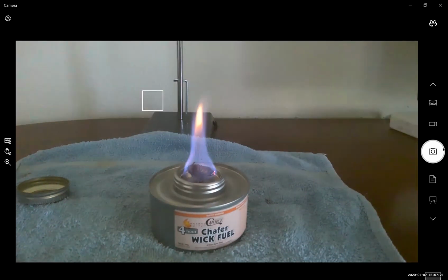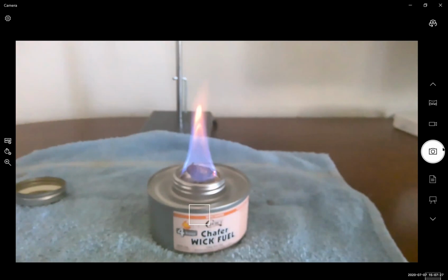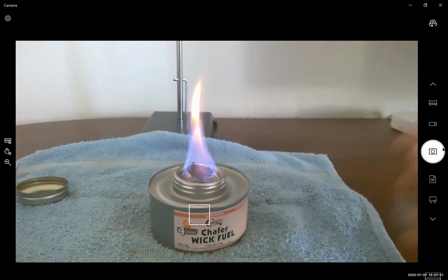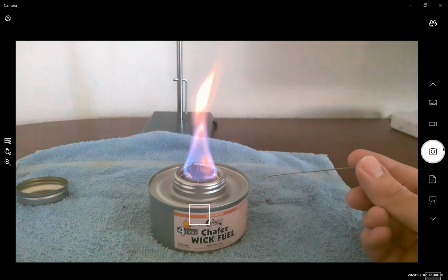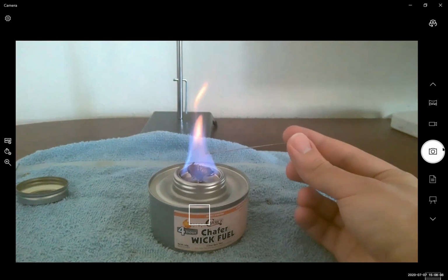Okay, let's look at lithium. And then I'll show you a bonus one if it's in your lab box, as there are a few colors that are pretty bright. Does everyone see that for lithium? Can everyone see that? This one's distinct. Does everyone see that beautiful red color? That is the flame test result for lithium and also strontium, which is used in road flares.